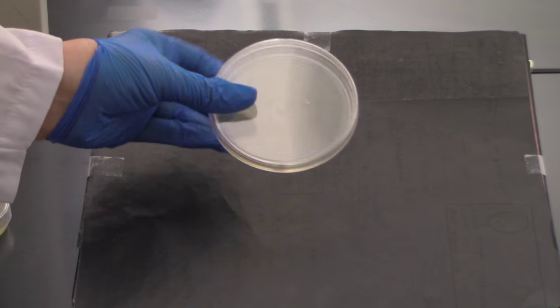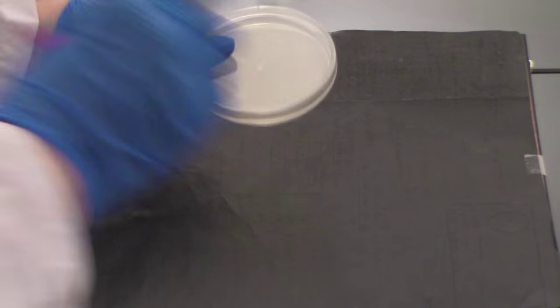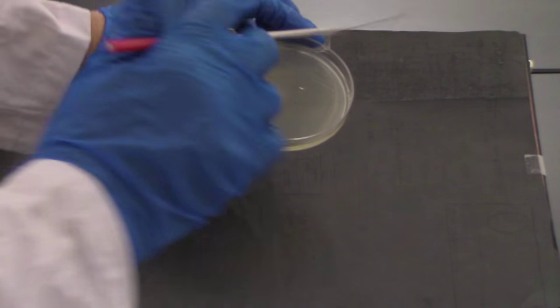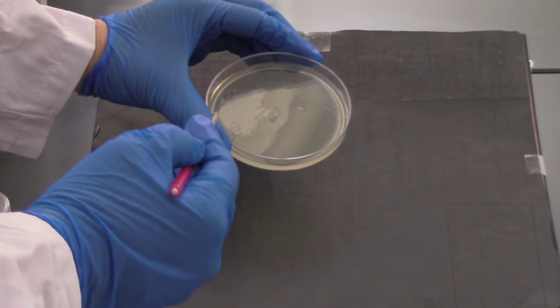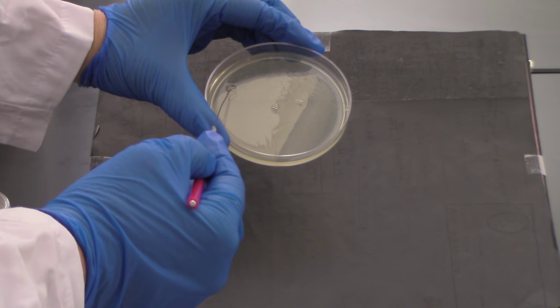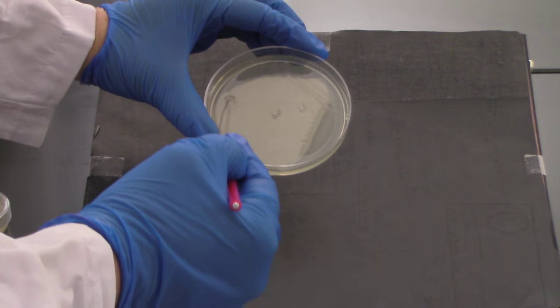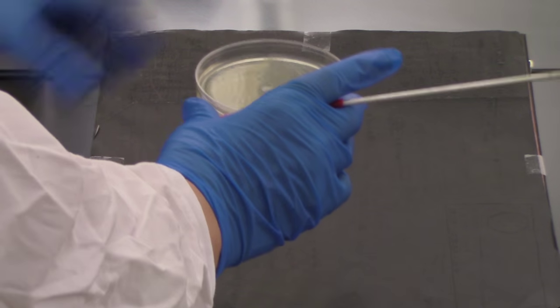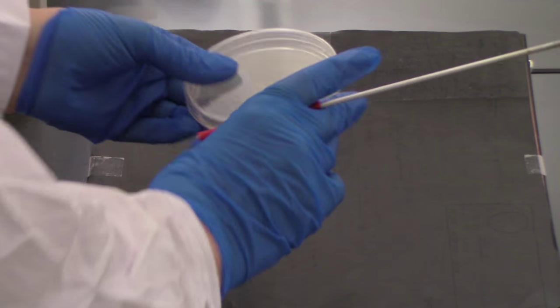Sterilize my loop, let it cool. Okay, it's been 30 seconds and my loop has cooled. I'm going to go back in again — taking the lid off just so we can see the procedure better. I'm going to go back through my last zigzag — this is my third one — several times, spreading that out. Then put the lid back on.